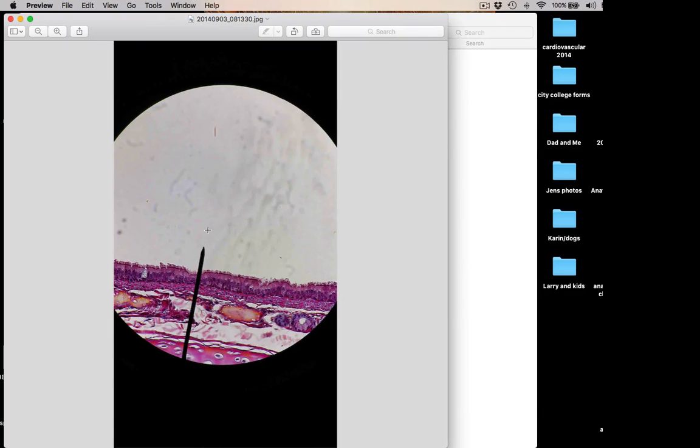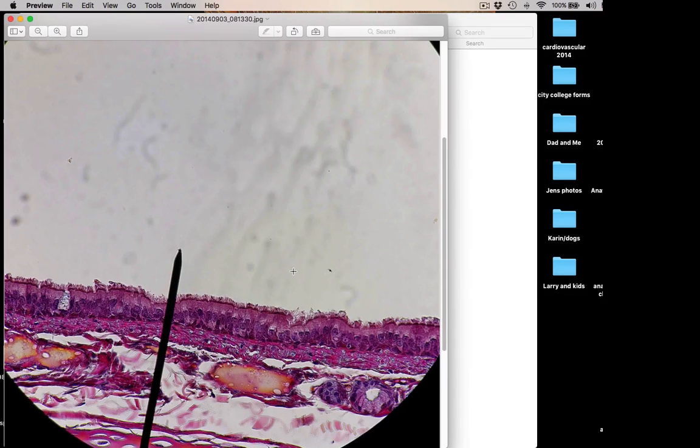Pointer in the lumen again. You can already tell, or at least you can see, that the apical region up here looks like cilia to me. Let's go closer. Yep, look at that cilia. Real easy to see. Does not look like microvilli. You can see the individual hairs up here, the cilia. This is going to be pseudostratified ciliated columnar epithelium. Here's a little goblet cell right here.